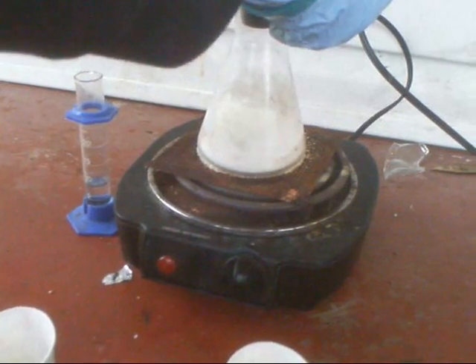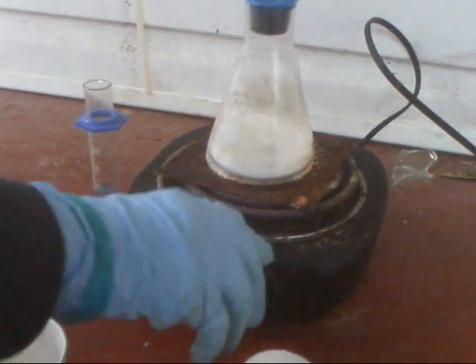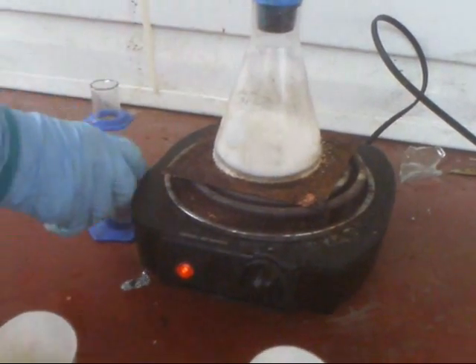Turn the hot plate on medium. I wouldn't recommend hot because it'll over-bubble and it'll spew everywhere.